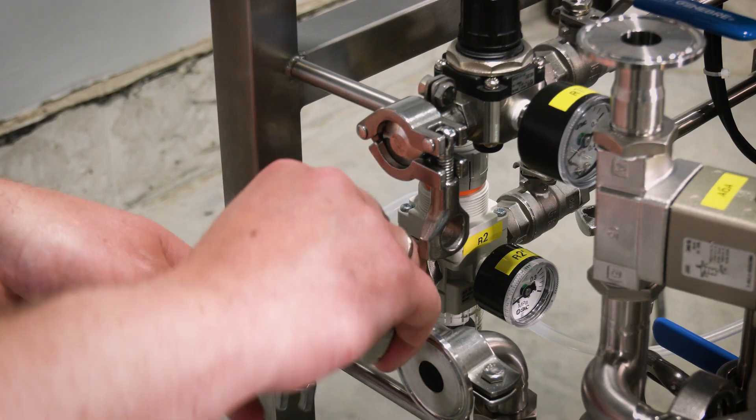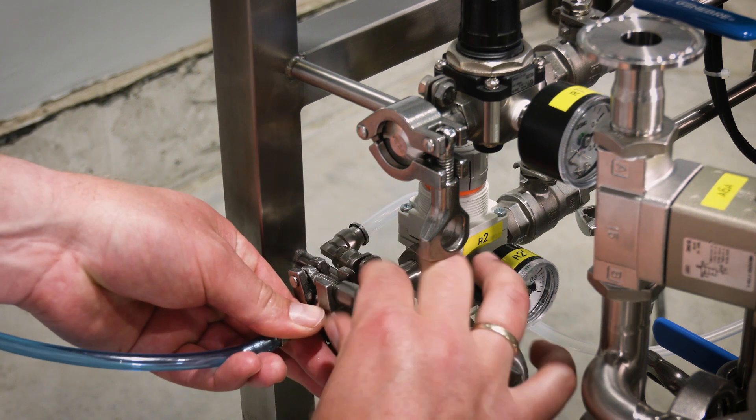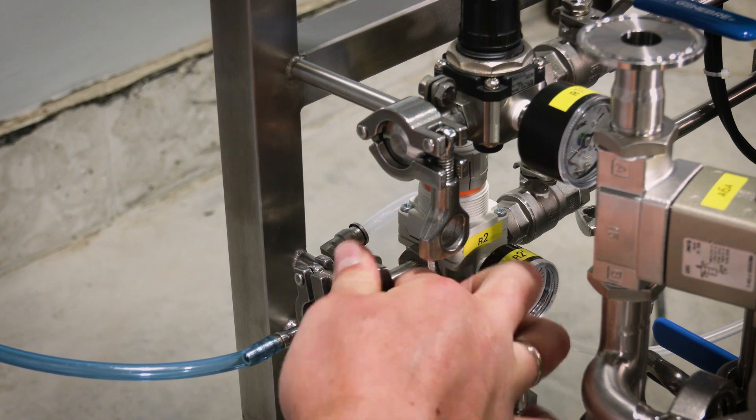Step 4. Connect the compressed air input to the technological skid using the appropriate hoses and tri-clamp connections. Pay attention to the proper alignment and attachment.